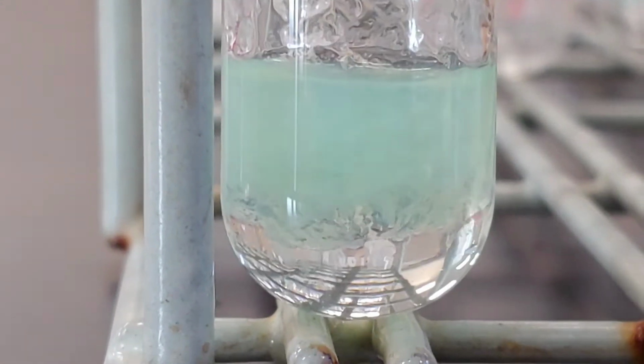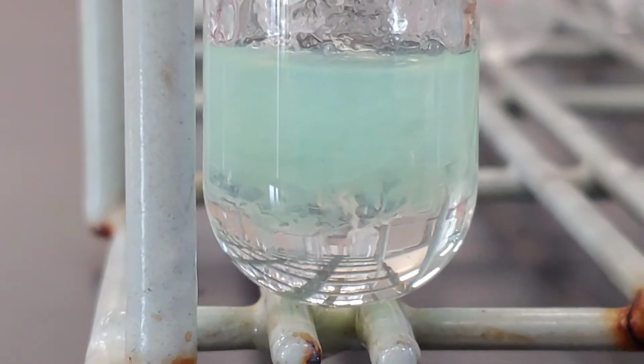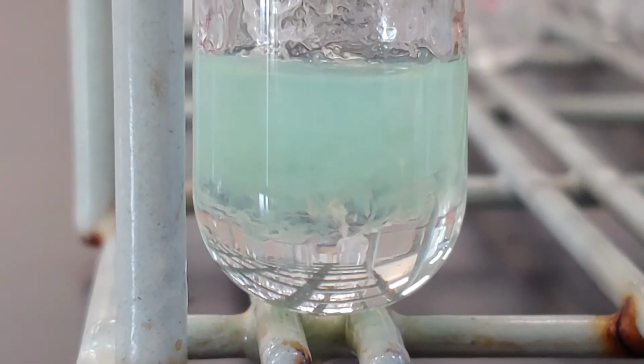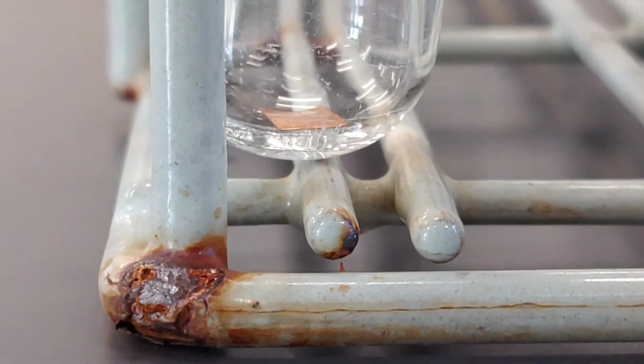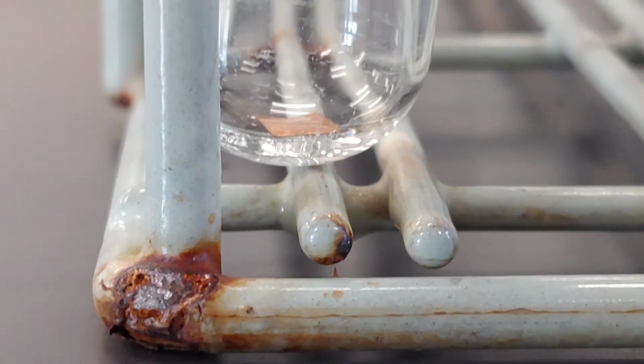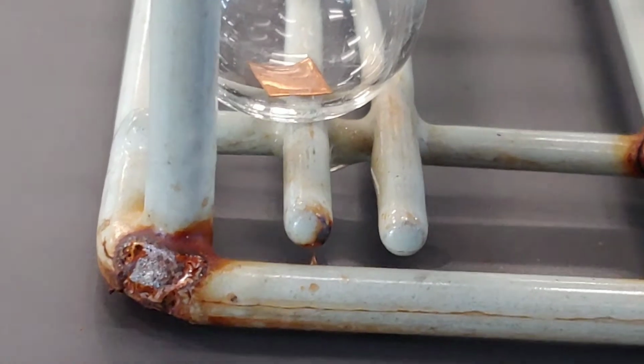Nickel nitrate plus sodium hydroxide. Give it a shake. Gelatinous would be the word I would use to describe that. All right, now on to reaction 7. This is copper metal. And to the copper metal, we are adding aqueous zinc nitrate. Copper metal plus aqueous zinc nitrate.